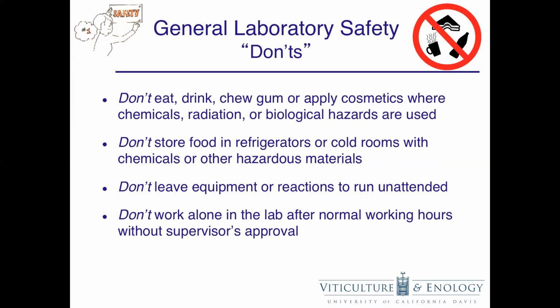Don't leave equipment or reactions running unattended. This could lead to unwanted accidents. Don't work alone in the lab after normal working hours without supervisor's approval. In the time of COVID, many people may find themselves working alone in the lab. However, you must discuss this with your PI.